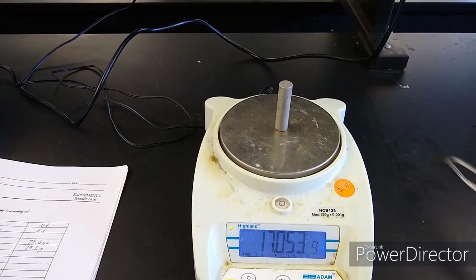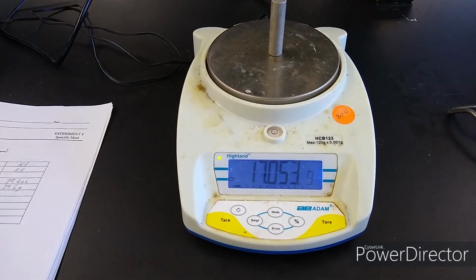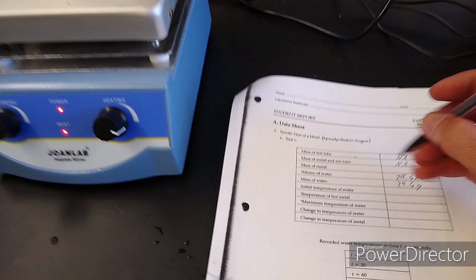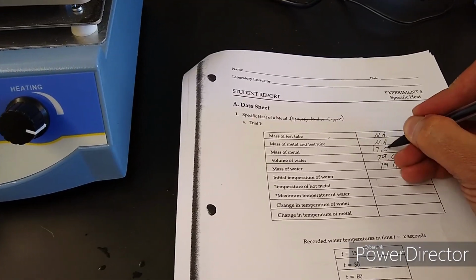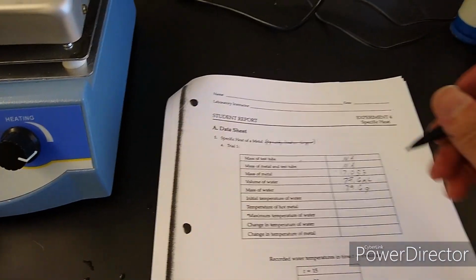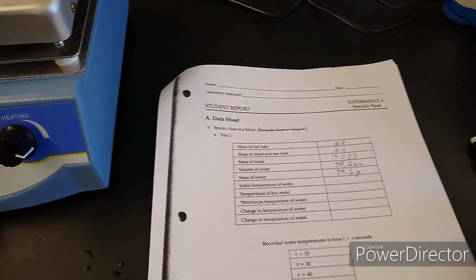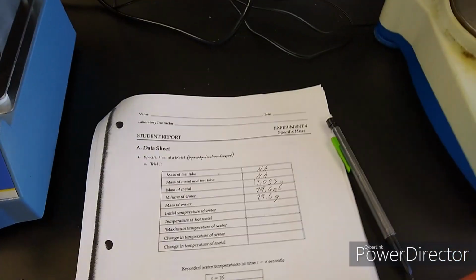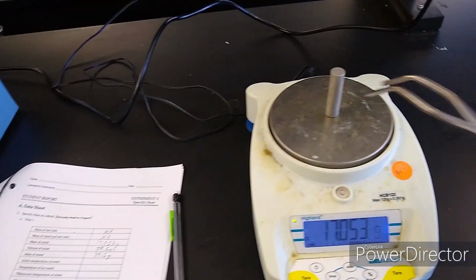And it's 17.053 grams. So let's write that down. 17.053 grams. Okay, don't forget your units. All right, let's put that back in the water.